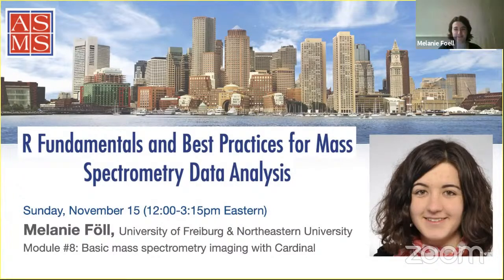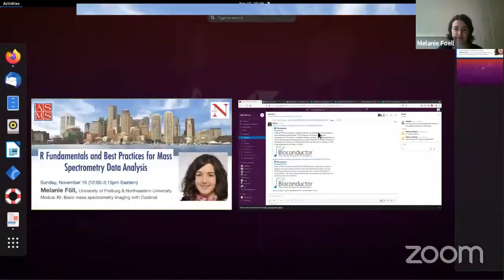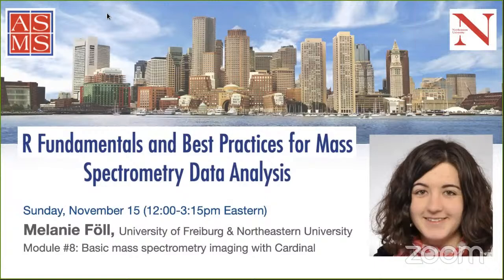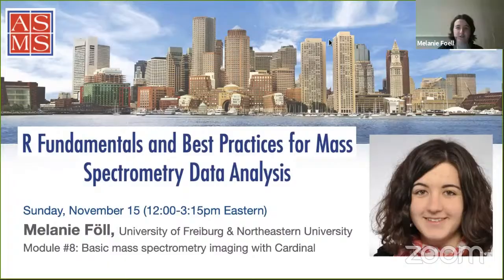Hello. So we will spend the remaining time of this course on mass spectrometry imaging, which is a very specialized but also very exciting mass spectrometry based technique. I hope you can see my screen. Yes, we can. All is good. Yeah, but I can't move my windows.